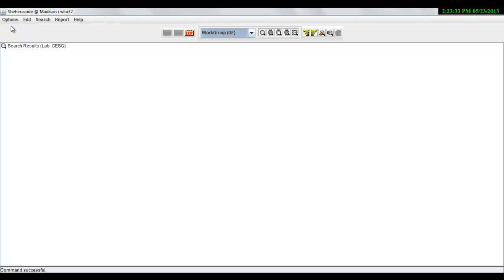In this tutorial, I will be detailing how to use the primer view in Sesame. The primer view in Sesame allows the user to record information on oligonucleotides synthesized as part of a project. The primer record contains information on the physical characteristics and location of the oligonucleotide.